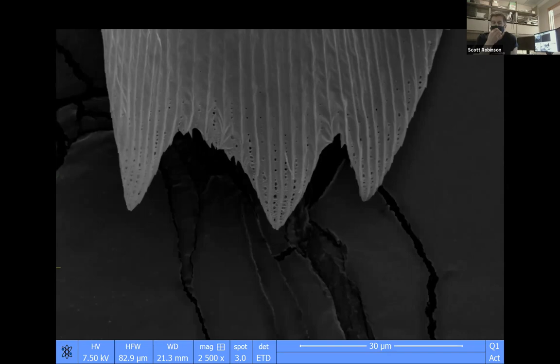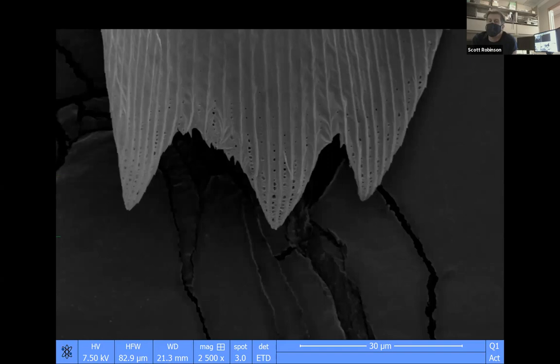So whenever somebody uses a sputter coater to coat a sample, maybe with 9 nanometers of gold palladium, we have to charge them 30 cents per nanometer for gold. And platinum, the price of platinum changes. It's about 45 cents for a nanometer. So a nanometer is a billionth of a meter. So we're coating something with a billionth of a meter, or several billionths of a meter, of a precious metal. And besides the charge for using the piece of equipment, it's 45 cents for platinum and 30 cents for a nanometer of gold.